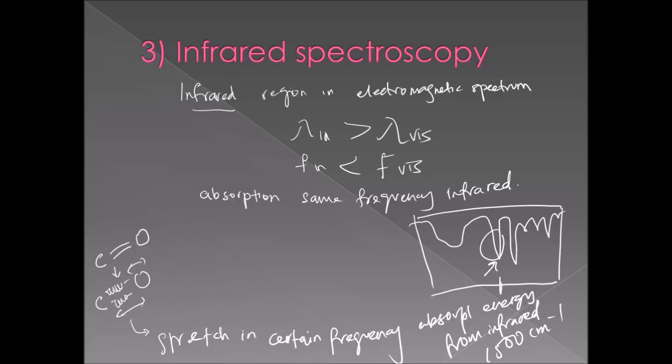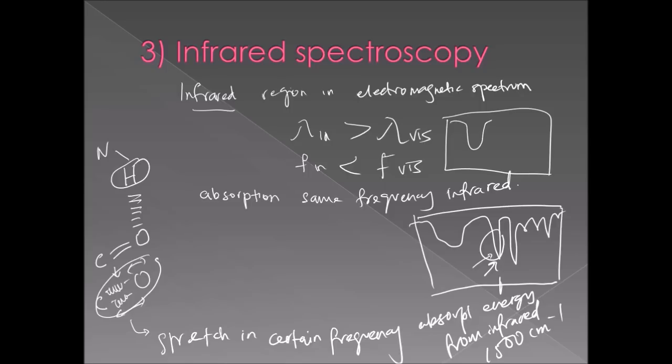If anything happens to the solid, for example, the carbonyl bond is possible to have hydrogen bond interaction with some other atom having hydrogen atoms. In this case, if the stretching pattern of the carbonyl bond changes as a result of interaction with the hydrogen atom, then there might be a shift in this peak. You may see the peak shift, and it becomes maybe 1590. So from there you might know that changes in intermolecular forces from one form to another have occurred.